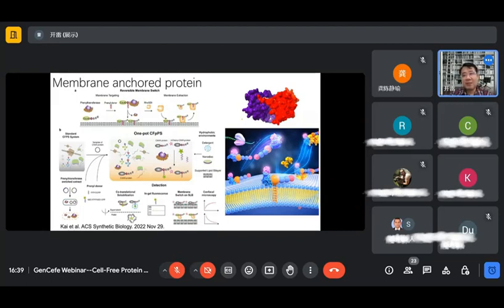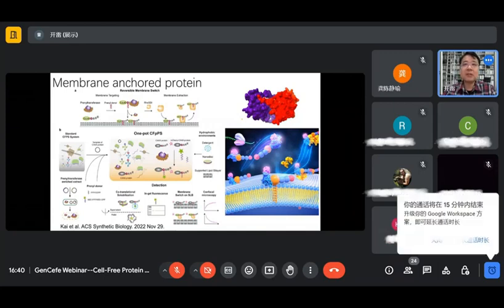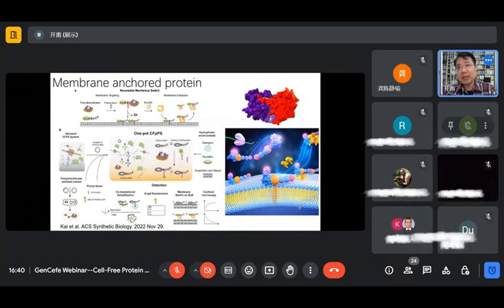And in this case, we investigated CDC42, which is a cell division protein, the central molecule for the development of cellular polarity. And the tricky part is this type of protein is really highly regulated. It interacts with more than 20 different proteins in a cell, and is constantly shuttling between the plasma membrane and the cytosol. And of course, it's a leading signal for establishing the tubulin as well as the cytoskeleton network. And therefore, getting sufficient and stable CDC42 is very challenging.